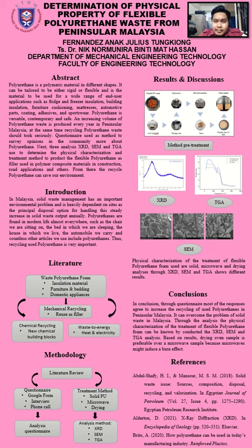Microwave structure has a smooth surface compared to the structure of the drying oven sample, as we can see in the scanning picture below. There is 200 times magnification for both microwave and drying oven samples. So this can show that the drying oven sample is much better than the microwave sample, because the microwave sample can cause a burn effect.